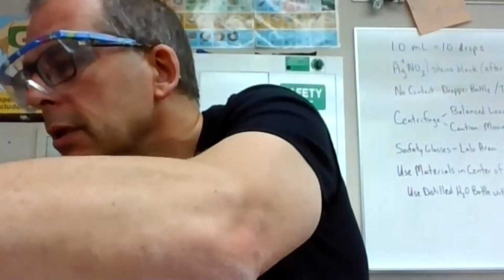And I'm not seeing anything happening there. A little bit of a dirty glass on this one, but no reaction. And then the next one I'm going to add to the strontium. And again, no reaction there. And the last one I'm going to add to the barium. And no reaction right here.